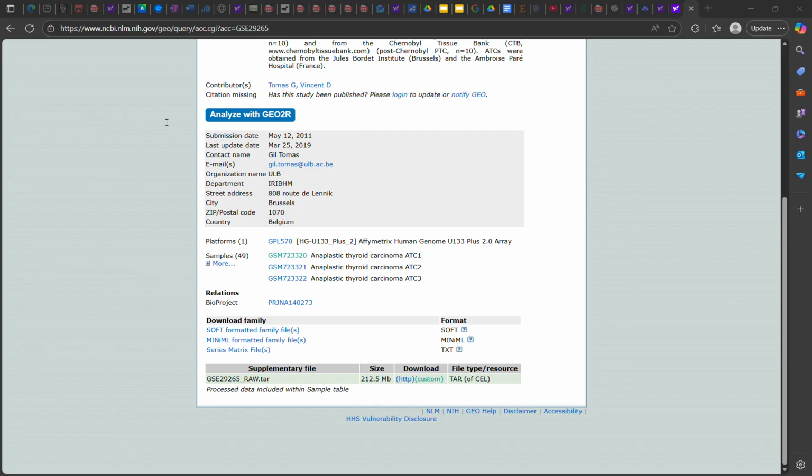Now we have the normalized data. We have a data frame version of normalized expression. Let's look at normalized data first. Just going to click on this here. As you can see, everything is in a bunch of basically sub-files. You can't really look at everything all at once, which is part of why we got that normalized expression thing.